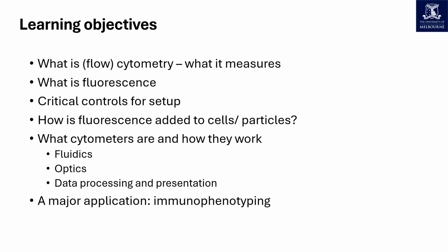The aim of this video is to introduce researchers and students who may have limited background in flow cytometry to this critical technology. I will take you through what flow cytometry and cytometers are, the types of particles that you can analyze, and the information you can retrieve and applications that are commonly used. You will learn what fluorescence is and critical controls that must be supplied. Then I'll take you through how cytometers work, how to interpret cytometry data, and end with how a major application, immunophenotyping, works.